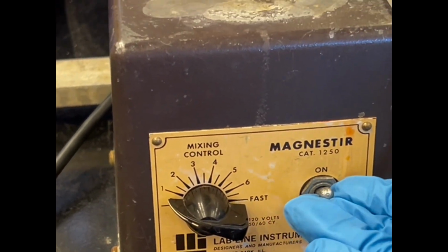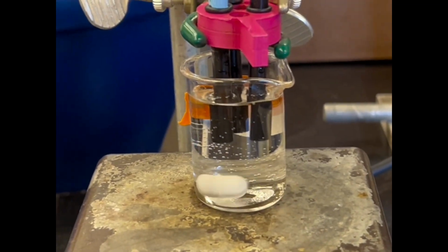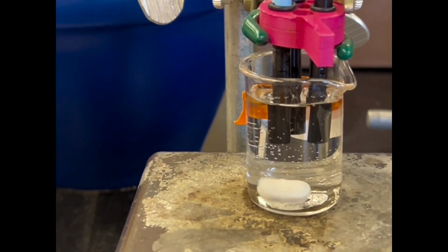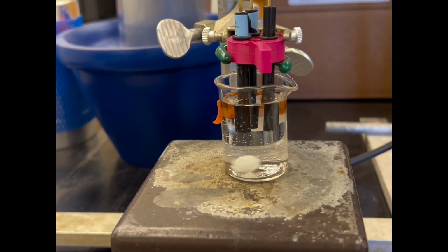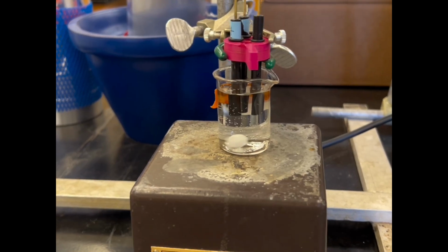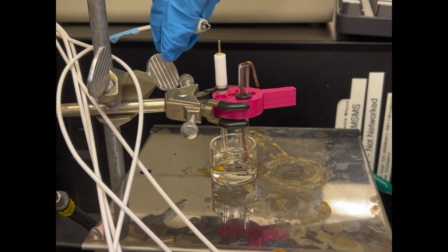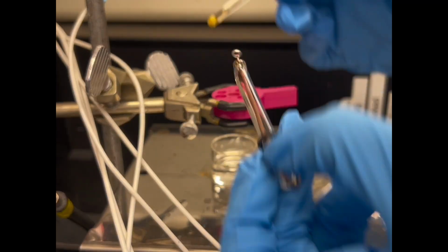When we're satisfied with the setup, we turn the stirring plate on. Timer for 20 minutes. While we're waiting for the template removal step, let's clean the reference and counter electrode.